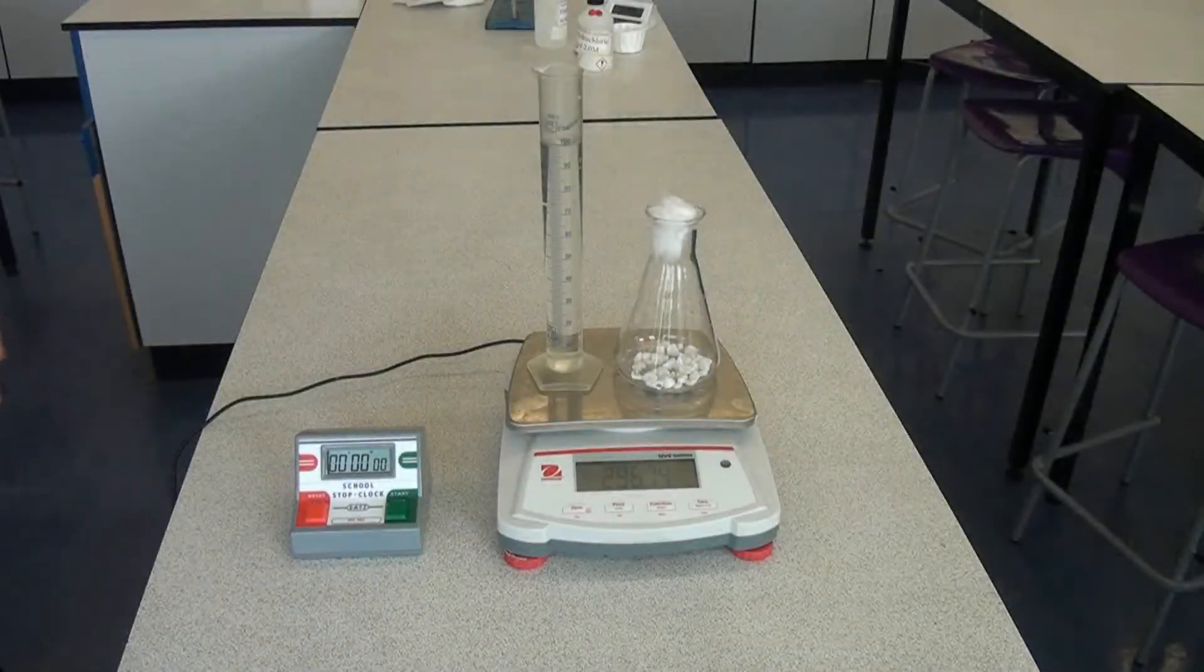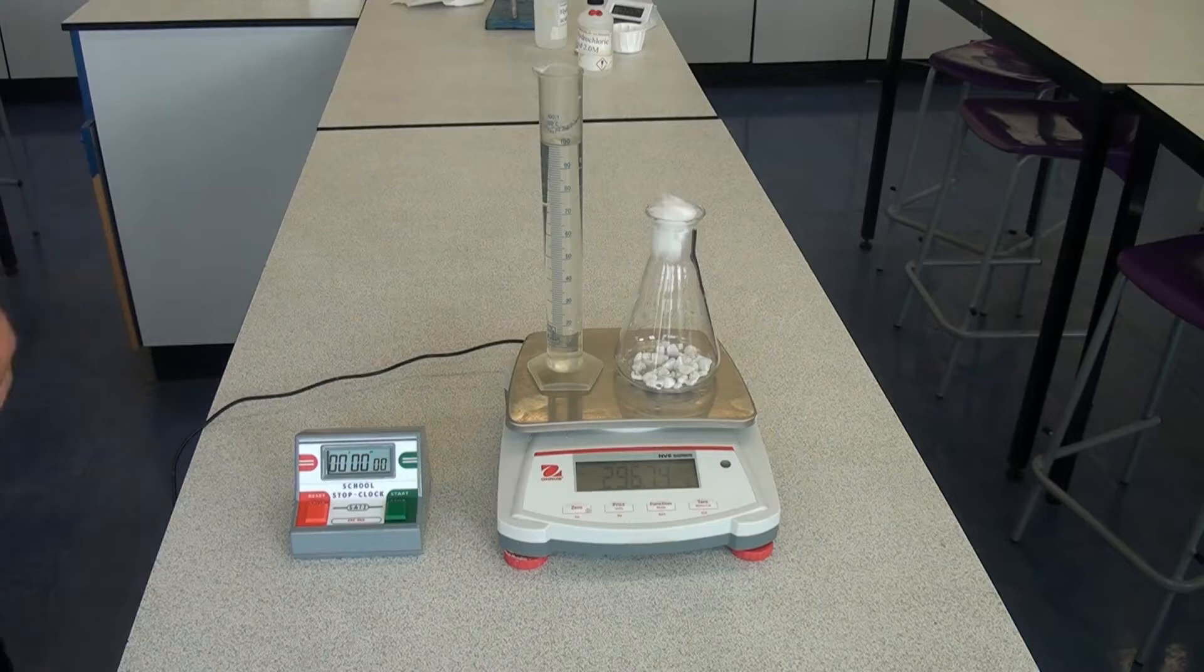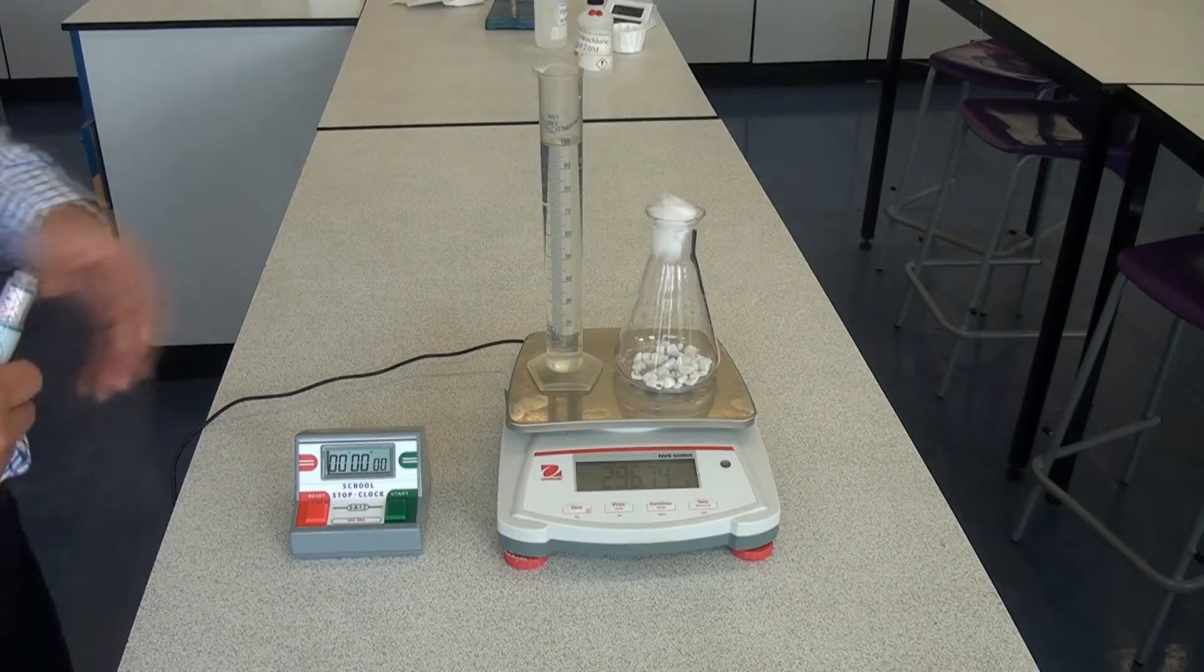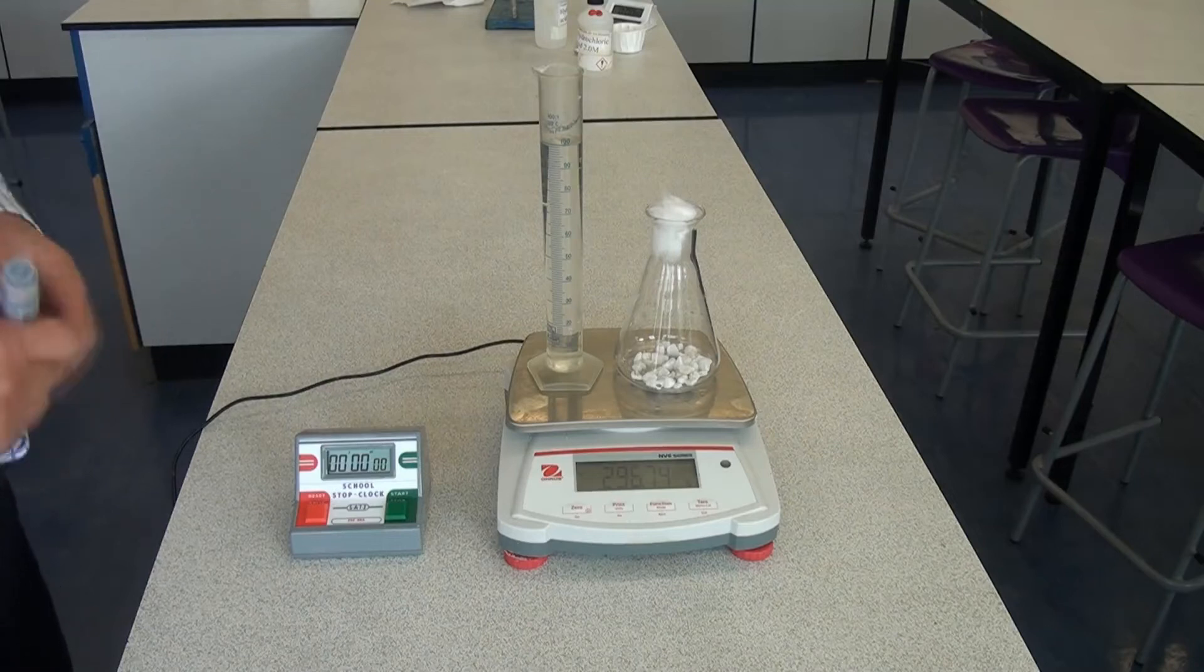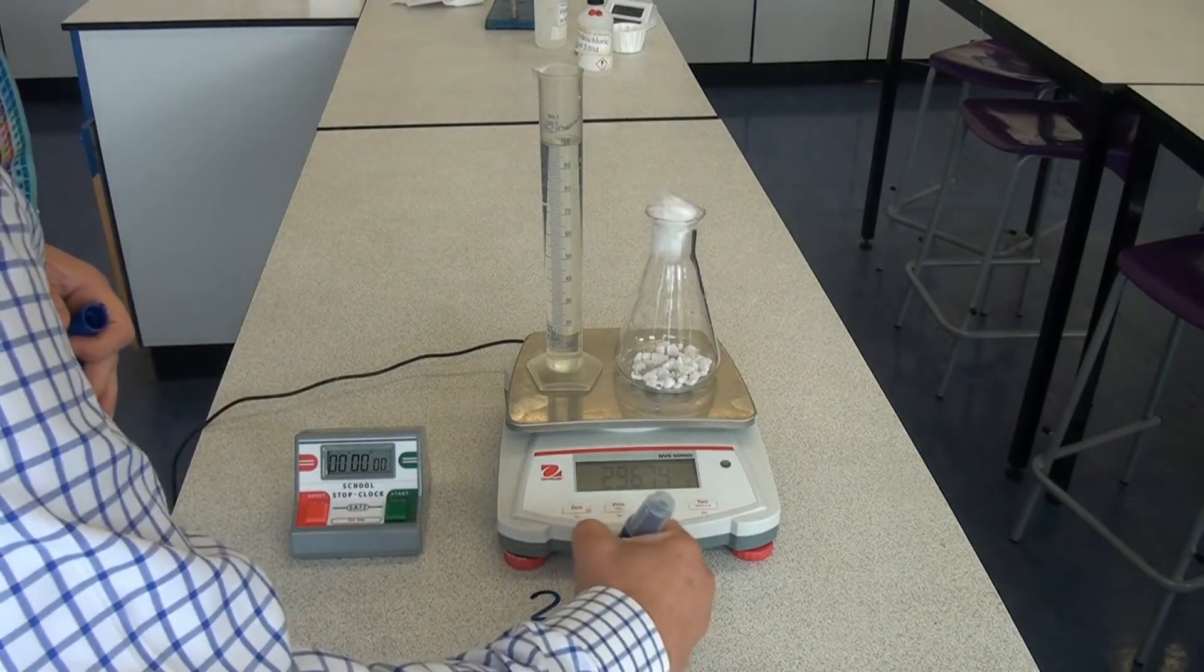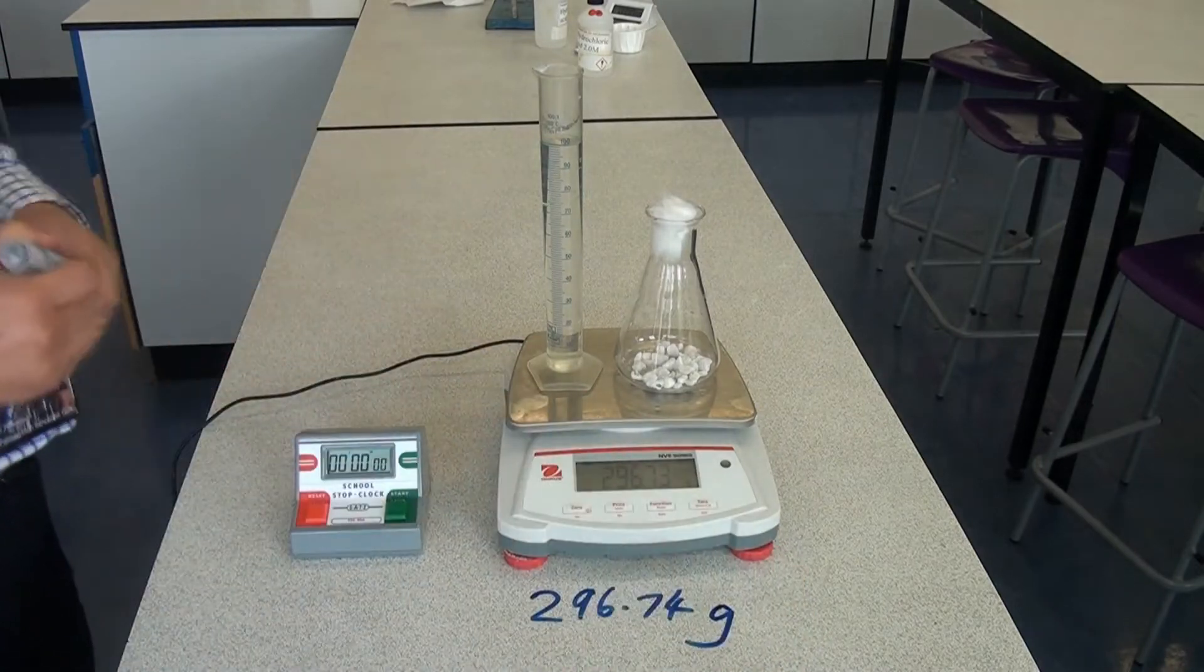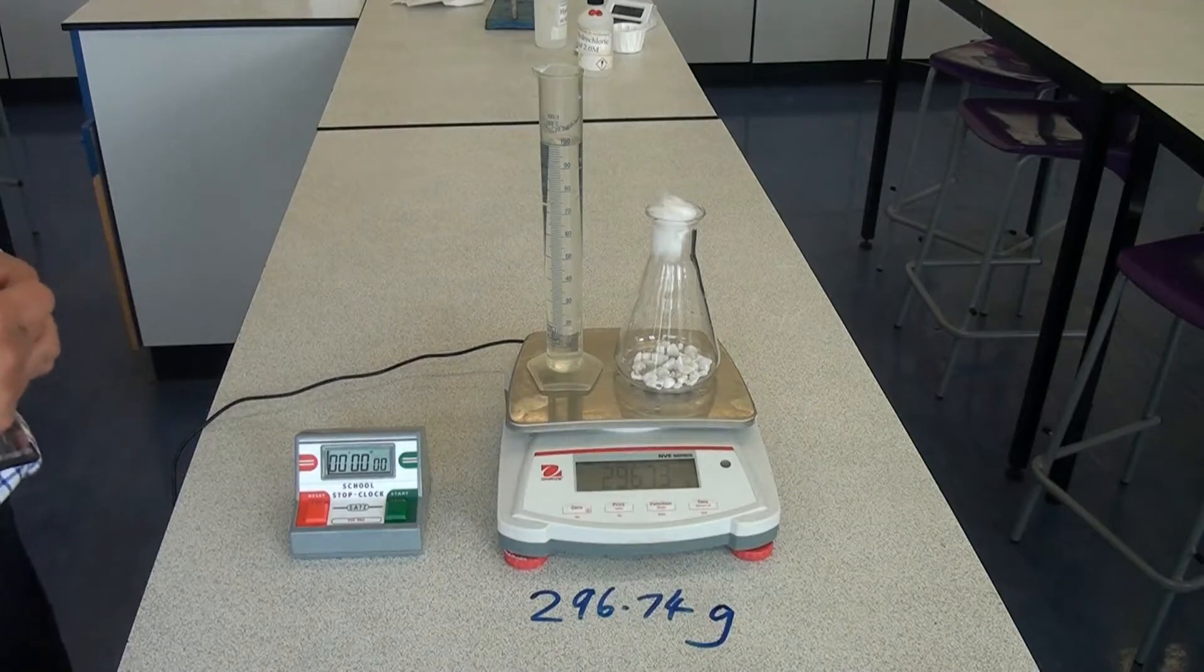So if the reaction does produce a gas, there is one other way that you can use to measure the rate of reaction. This time, we're not measuring the volume of gas given off. We're measuring the mass of the contents of the flask. So if I write down the mass to start with, it's 296.74 grams. And that's all of the equipment and all of the reactants inside.